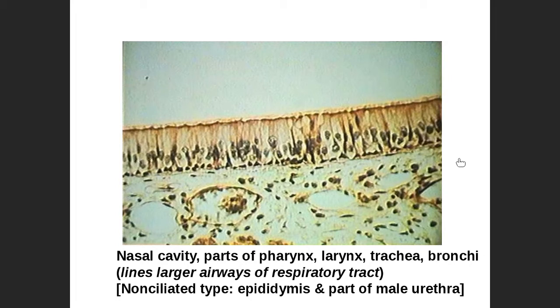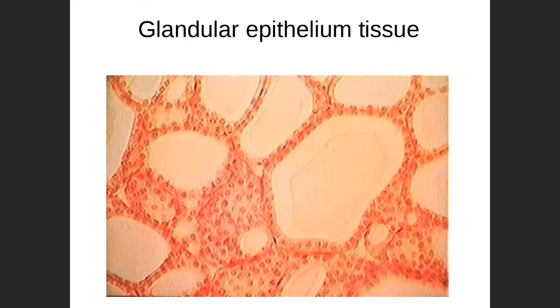All right, let's jump into what's called glandular epithelial tissue. You'll talk about this in more detail in chapter 17 when you get to the endocrine system, because this is actually a picture of the thyroid gland. But if you look closely, glandular epithelial tissue is basically simple cuboidal epithelium. These are cuboidal cells. They have the nuclei at the center, nice spherical shaped nuclei. This dark red line here, that you can see a little better in some areas, tougher to see in here, that's the basement membrane.